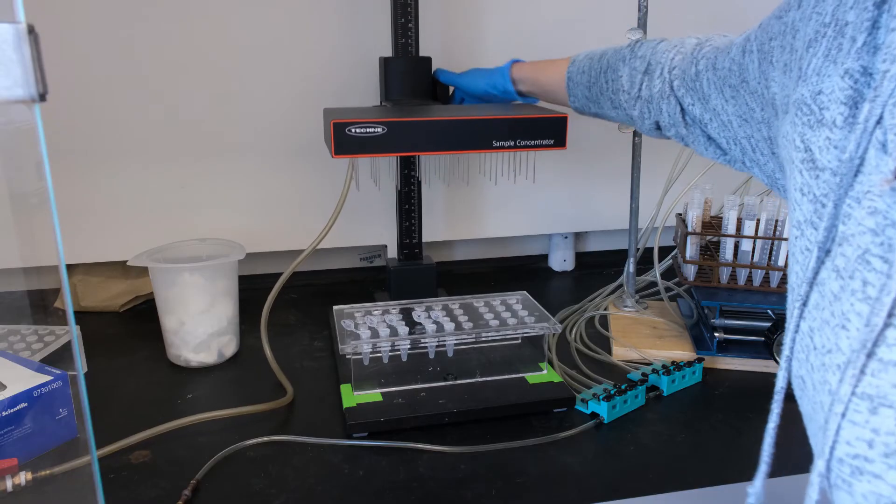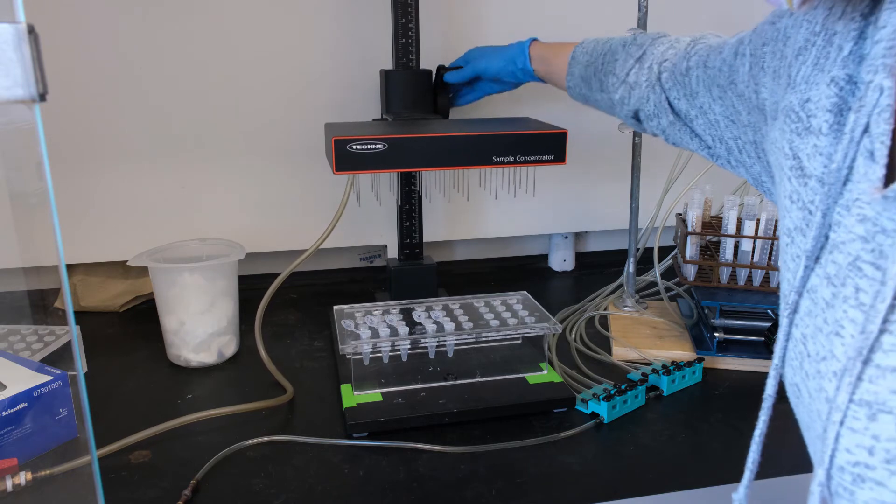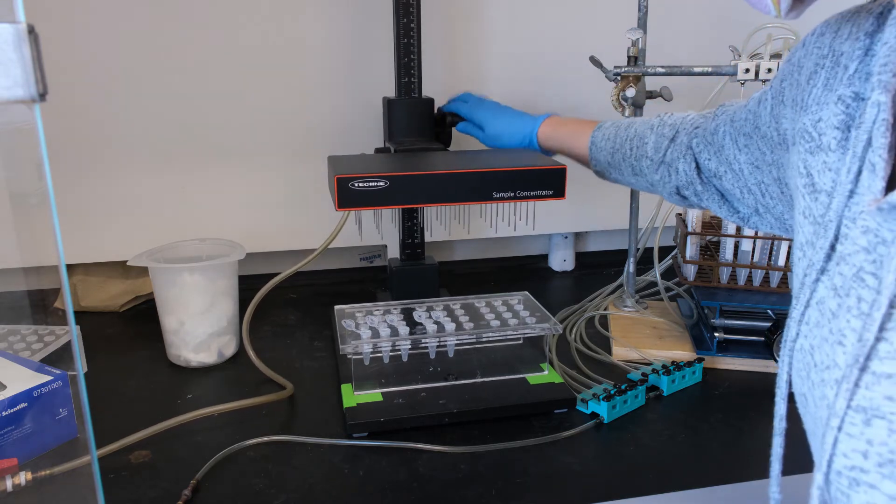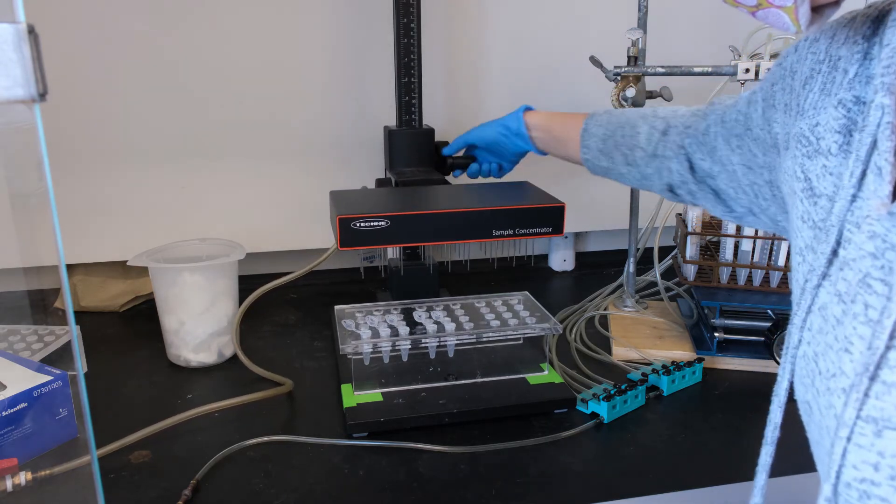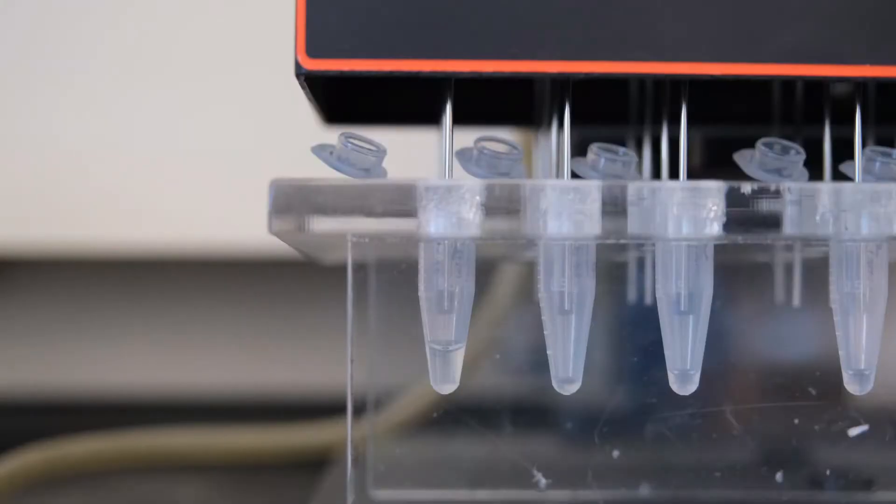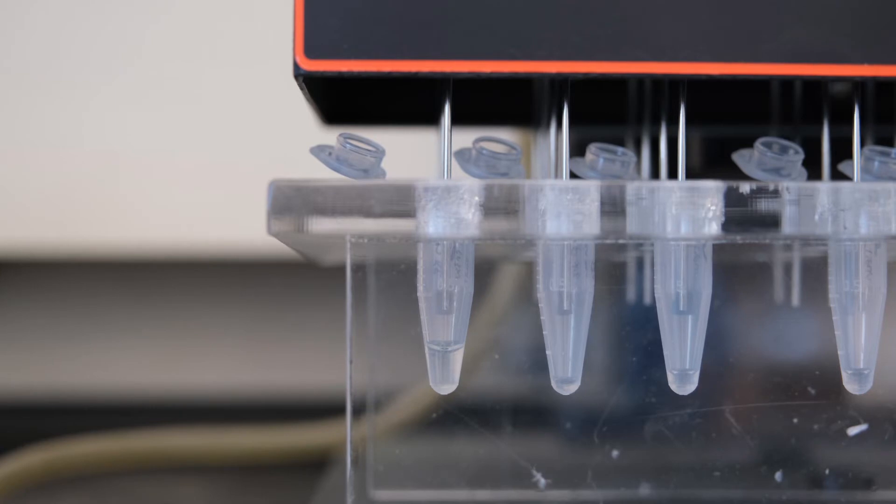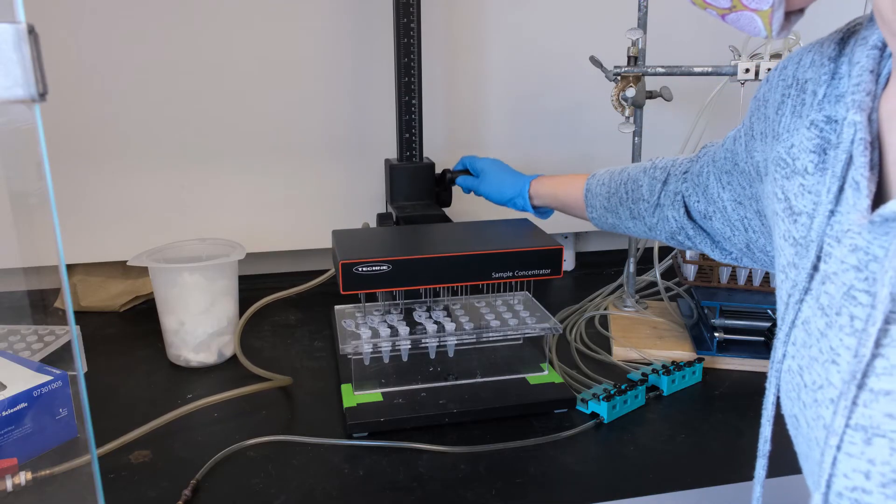Lower the needles using the knob. Pay attention as the needles approach the tubes. Watch closely and adjust as needed. Position the needles such that they enter the tops of the tubes, leaving space between needle and liquid. Do not touch the needle to the liquid. Lower slowly and watch your tubes.